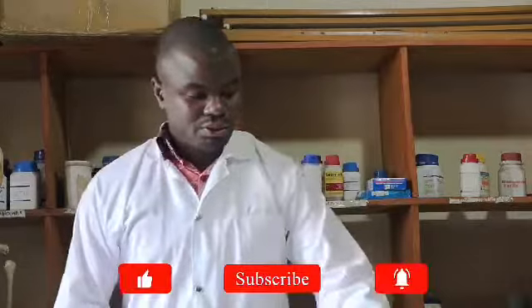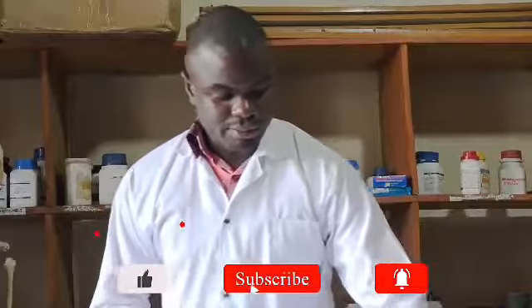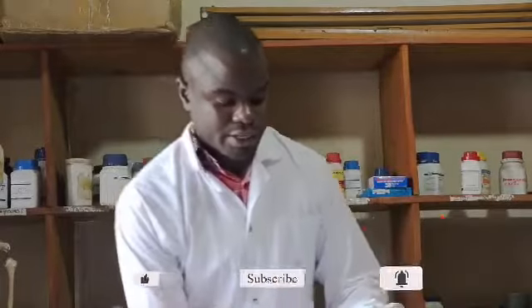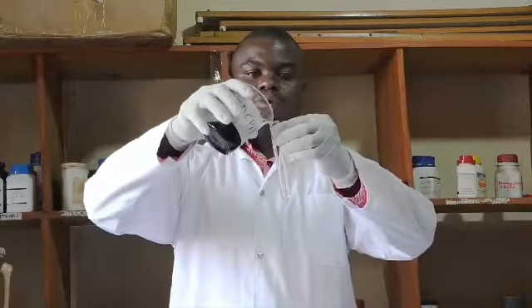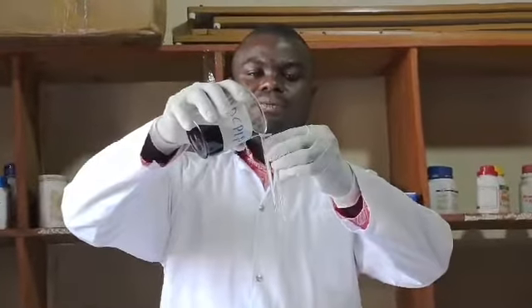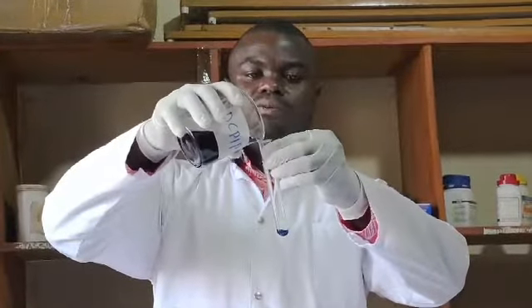So we shall start with solution X. We shall get our DCPIP and we pour one cubic centimeter. Take note of the color of DCPIP in the test tube.